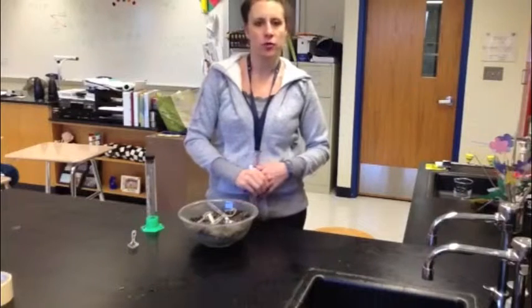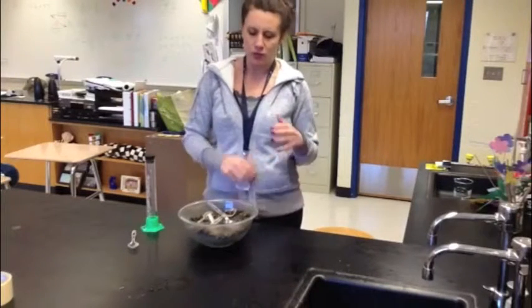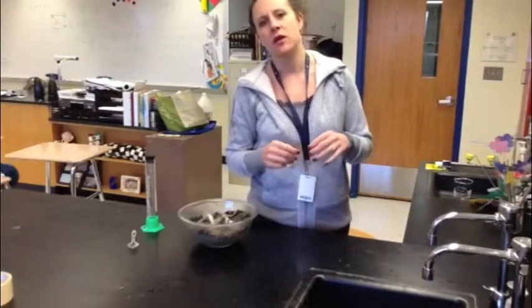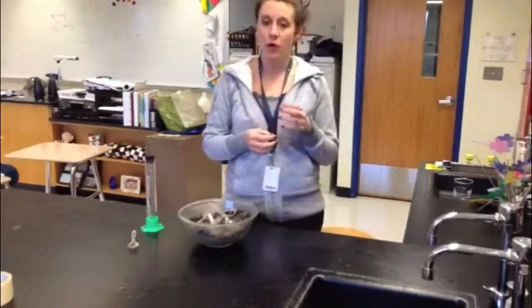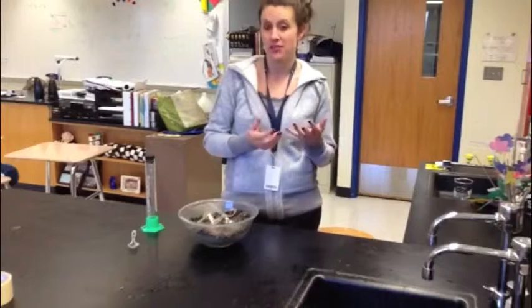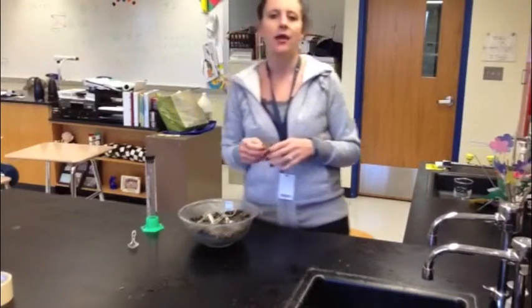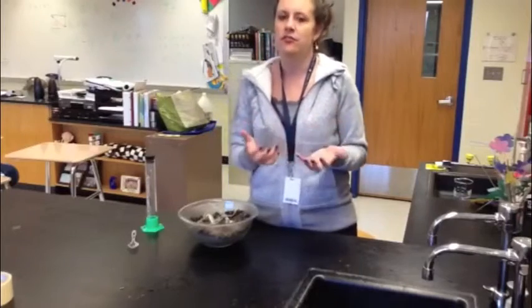This is Station 1 of the Soil Lab, and Station 1 is going to talk about soil texture. Texture actually means what something is made of, how it feels, how it appears, how it looks. For soil texture, what we're actually going to be looking at is what is actually inside of the soil itself.